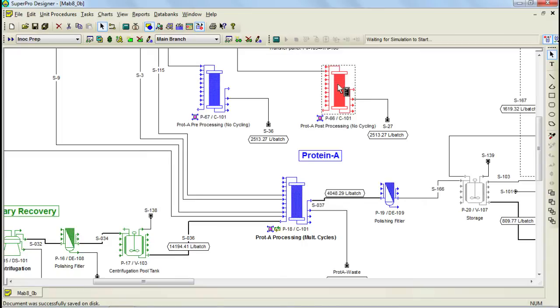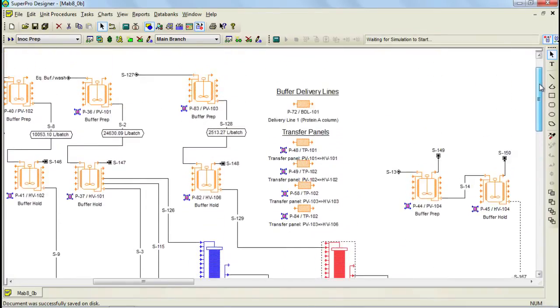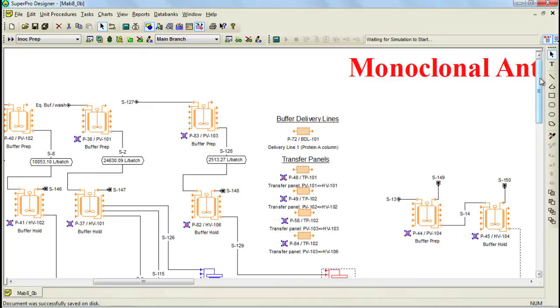Let's now continue the tutorial by discussing how to model transfer panels and buffer delivery lines. Transfer panels can be modeled by accounting for their time of usage and scheduling using a generic box. As you can see here, transfer panels are not connected to any part of the process, but they do account for the transfer time required to transfer the buffer from the preparation vessel into the holding vessel. In SuperPro Designer, a generic box is a unit procedure that can be used to represent batch processing steps not explicitly available in the current version. In this case, they are used to represent transfer panels.